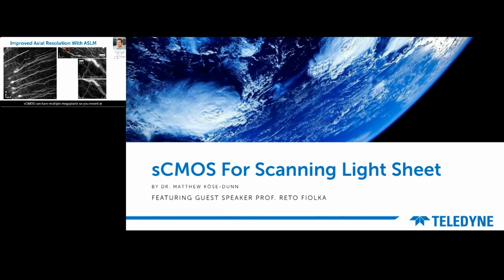And thanks to light sheet microscopy and the progress on cameras, so today's sCMOS can have multiple megapixels, so you record at the time millionfold parallelized. So you can in one exposure of the camera record millions of pixels, in contrast to the single pixel that the confocal microscope acquires. So very large volumes can now be acquired in a matter of hours to days instead of weeks to months, and so it becomes more tractable.